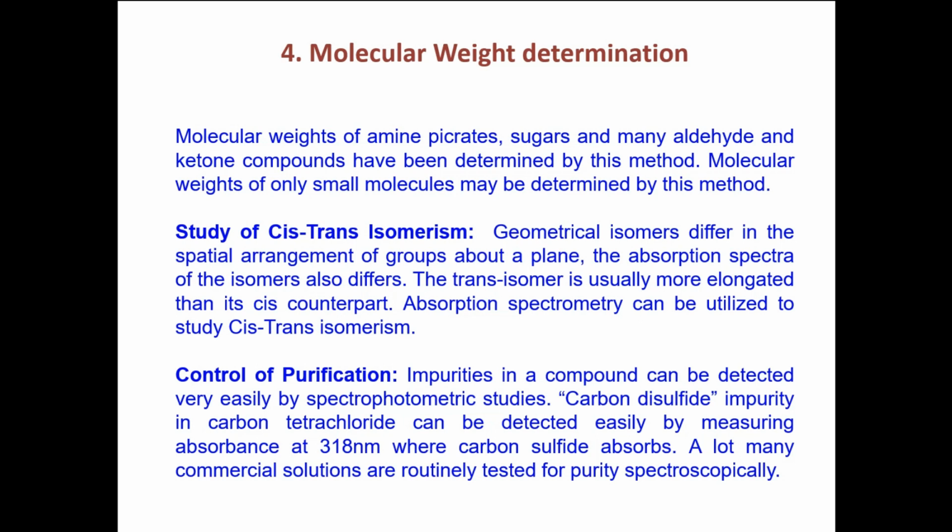For example, the molecular weight of amine picrates, sugars, and many aldehydes, ketones, and other compounds are also determined by using UV visible spectrophotometry. So for molecular weights, there is a specific formula, capital M equals small a, small w, small b by OD.